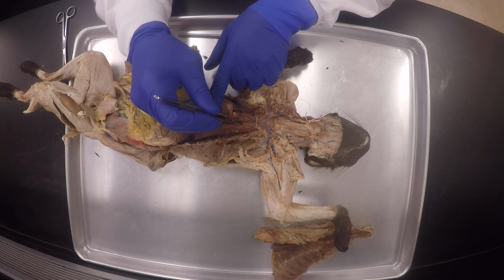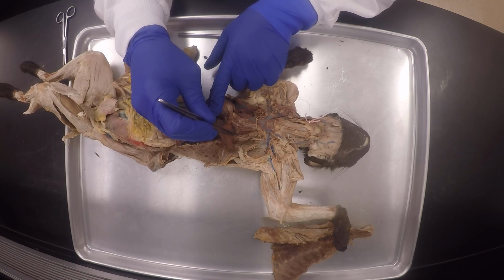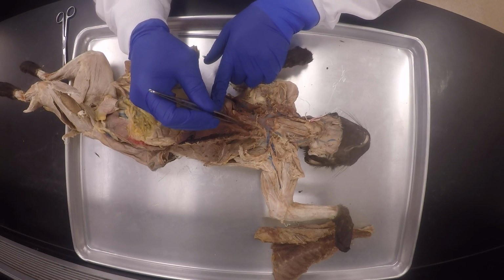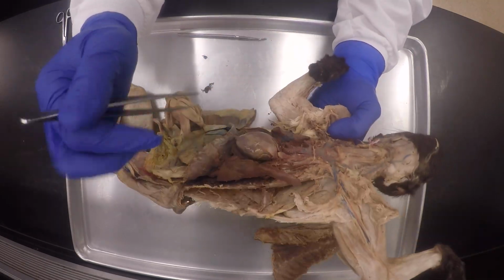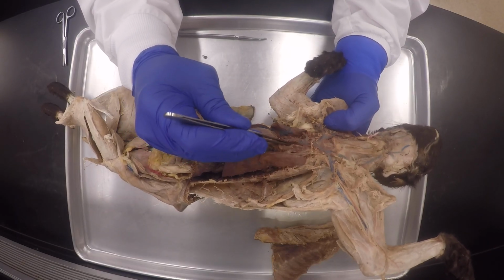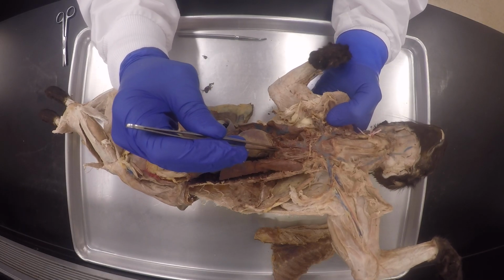And so there is the brachiocephalic trunk, and you could see here it's not very well infused, my good friends, and these are nerves, obviously. So there's the aorta. You can see a little bit of the arch here.